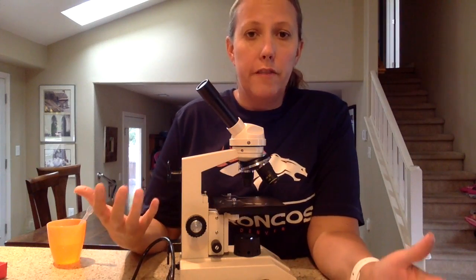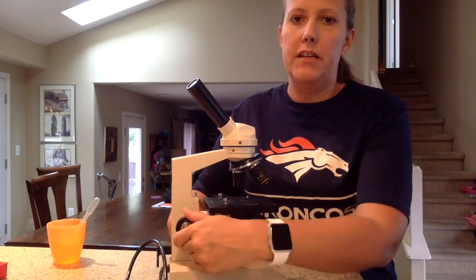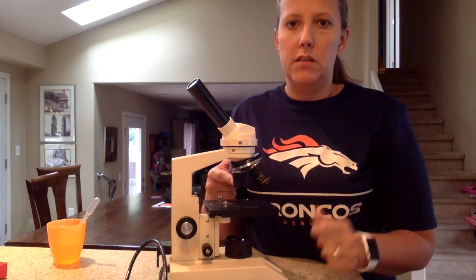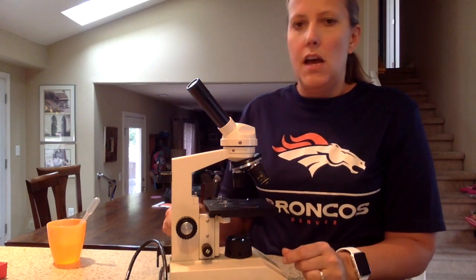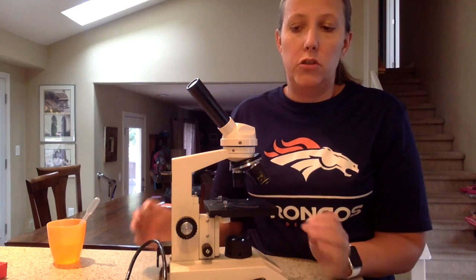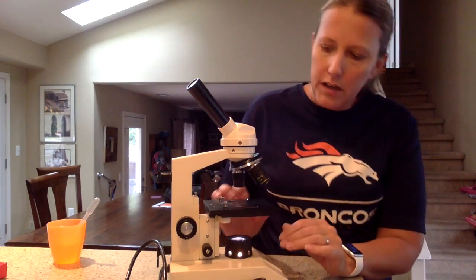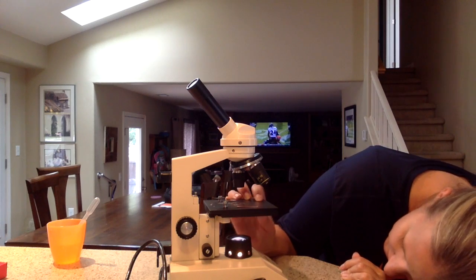Other things you should find with your microscope: you should find that the stage is all the way down. Whenever we put them away, we make sure the stage is all the way down to the bottom. You also want to find that the shortest objective — the low-power objective — is facing down. If they're not like that when you find it, please report it to the teacher and then set it up like that, because you should always start with the stage down and the low-power down. You'll need to turn the light on and adjust the diaphragm so that the largest amount of light is coming through.